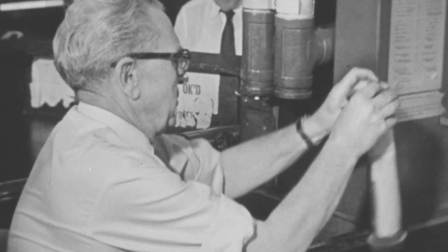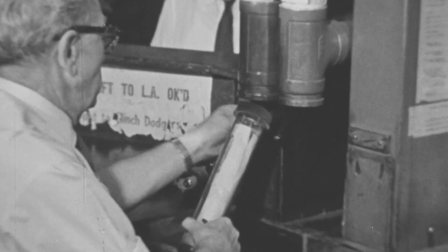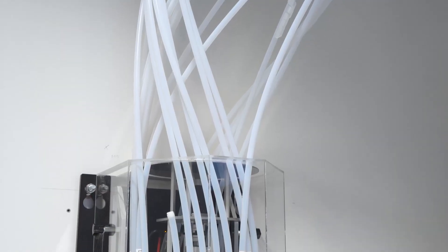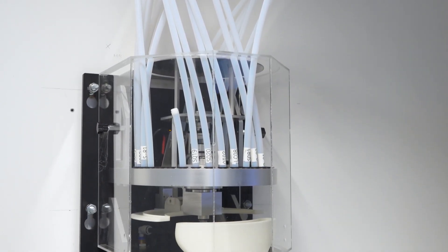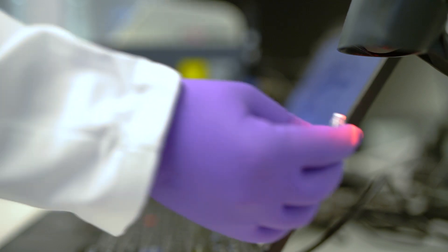For centuries pneumatic tube networks have been used to transport everything from money to aircraft parts. So why not lab specimens? Today a system just like these is used to speed drug discovery at Novartis.